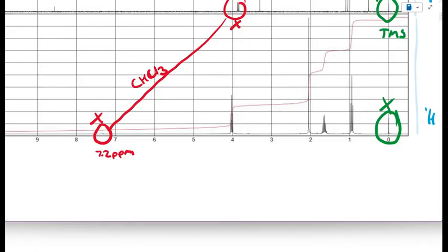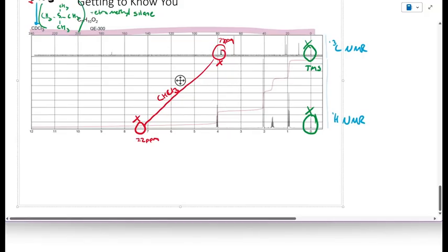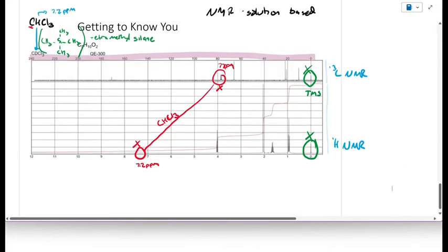So we started back at the left side, and starting from the left, there were no pixels under the curve, no pixels, so relatively flat, staying around 0. Here, now there's an actual signal, so the integral curve jumps up because it's counting the number of pixels under that curve. Then it goes along for another region where there's no signal, and then another signal, so that jumps up again, and jumps up again. So each vertical jump is represented by one of the signals, and that tells us how many hydrogens are represented by that signal. The vertical portion of the integral curve is proportional to the number of hydrogens represented by the signal. So how do we analyze something like this?